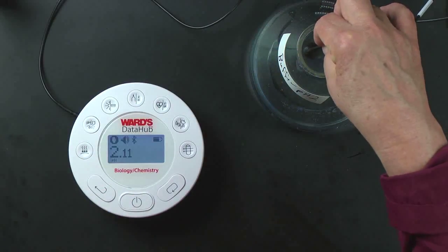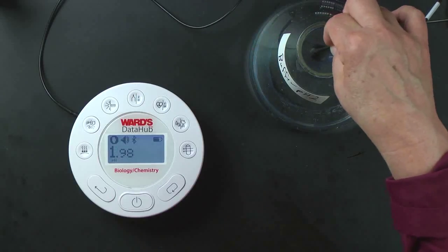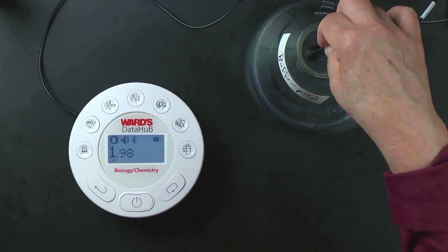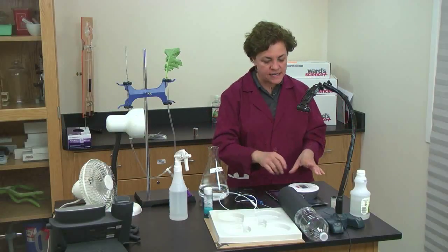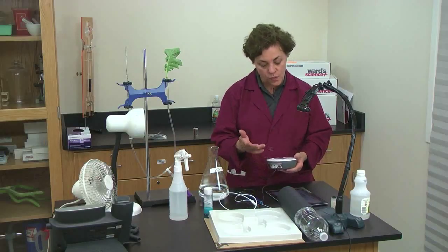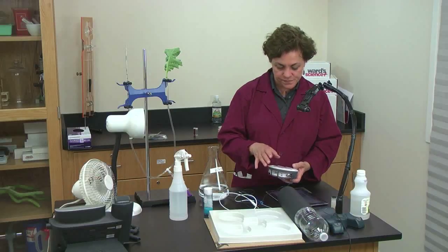As you can see, the numbers are about 1.98. I think it came pretty close. So they can compare between that pH and the vinegar pH and see how close it is, and test the flies to see which they prefer, or the sow bugs, because the kit comes with both.